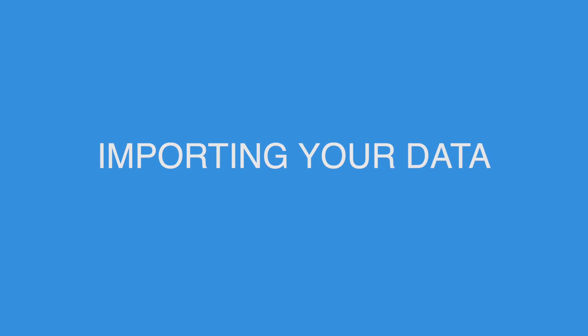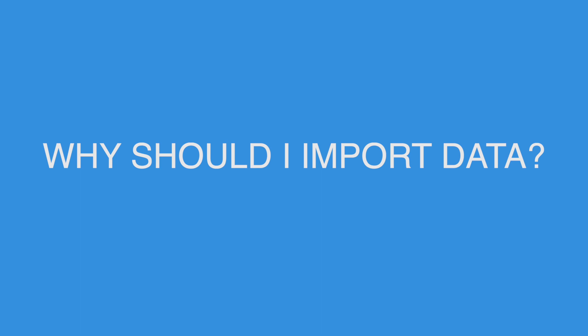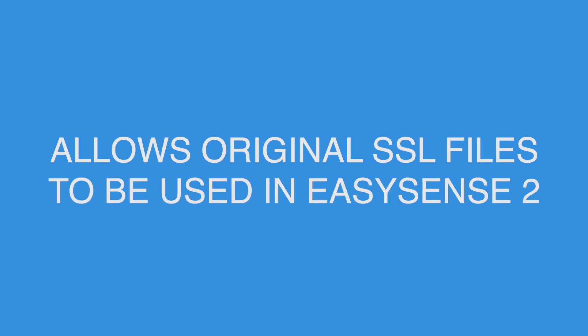We are now going to look at importing in the EasySense 2 software, either by file or device. The ability to import files has a few key benefits. Firstly, for users of our EasySense 1 software, you can import your original SSL files and save them in the new ES2 format.